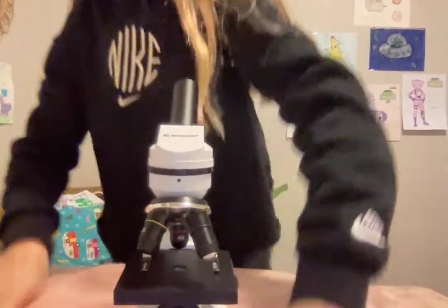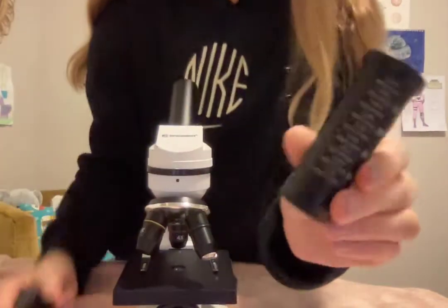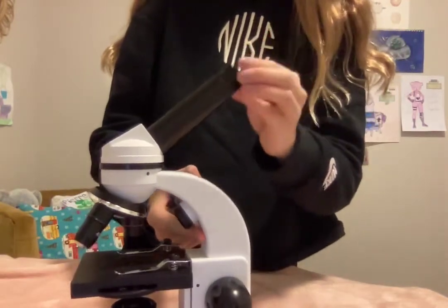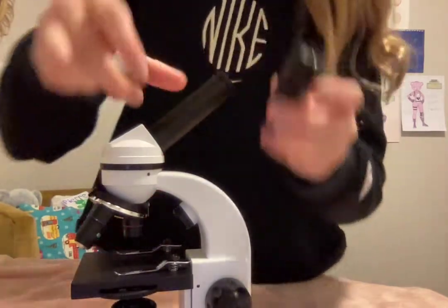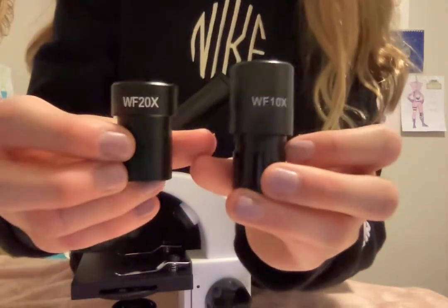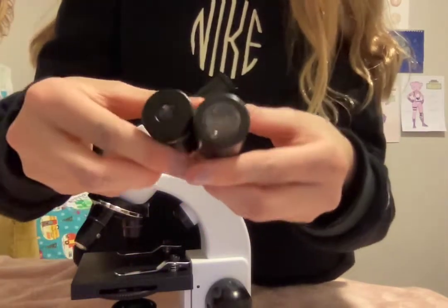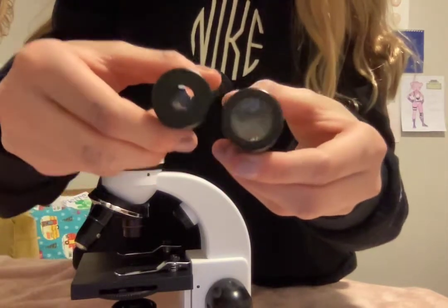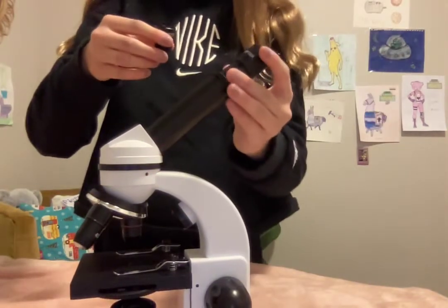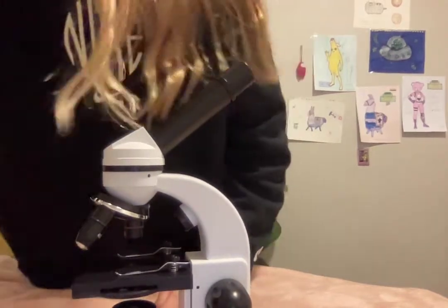You take this big eyepiece and you put it in right here. Now I have another hole — then you have these two: the 10x and 20x. I usually use the 10x. It has a bigger piece for your eyes to see. The 20x is smaller and not as zoomed in. So I'm going to put the 10x in and leave the other one there.